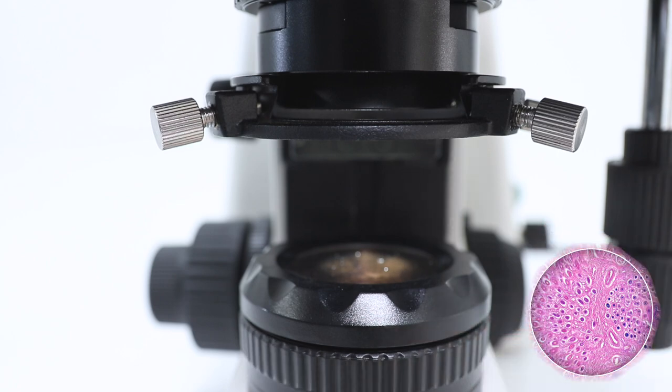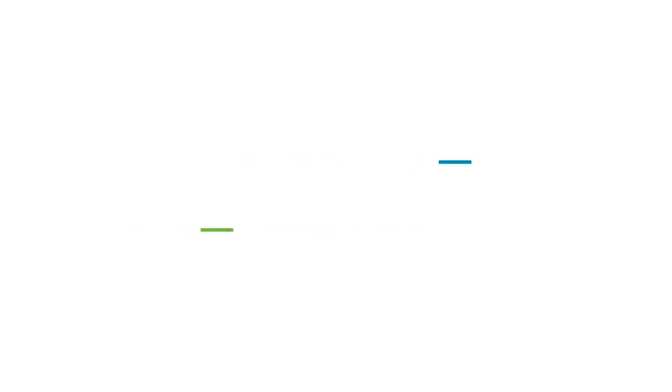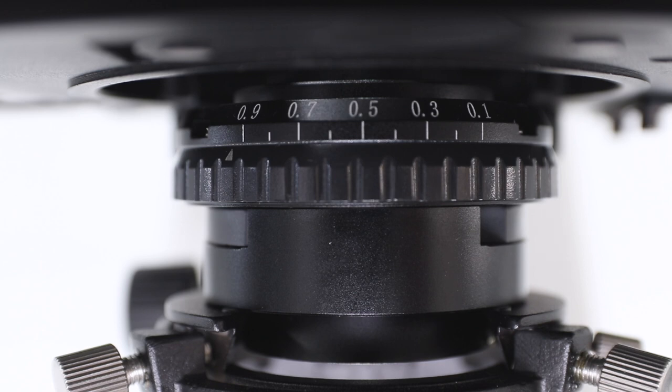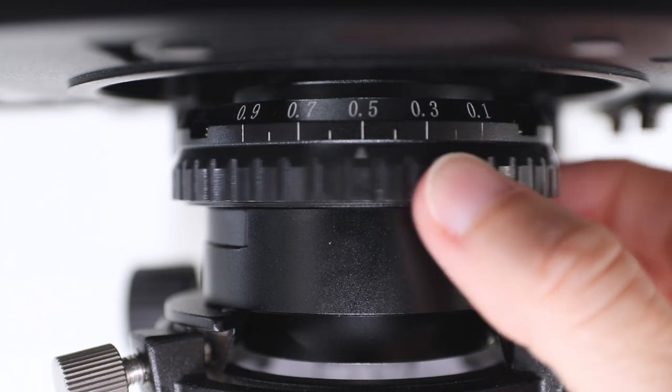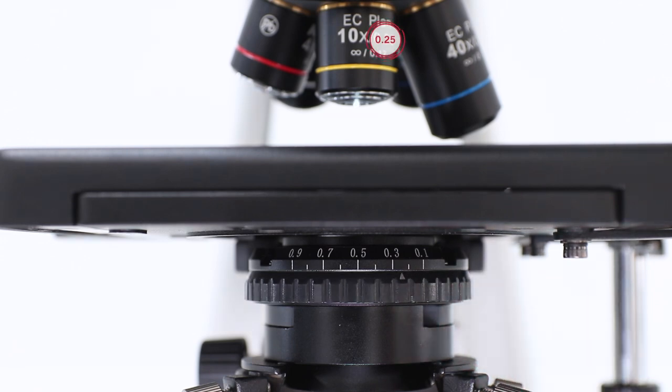For the aperture diaphragm, depending on the condenser, this can display different scales showing either the aperture or the magnification of the objectives. The aperture diaphragm should be adjusted in accordance with the numerical aperture of the objective to obtain a well-balanced image in terms of brightness and contrast. Use the same numerical aperture of the objective, or as we recommend, use a little bit less than indicated to get even better results.